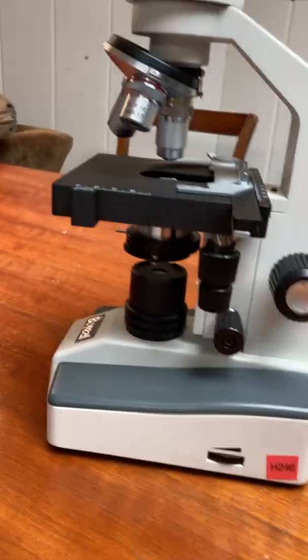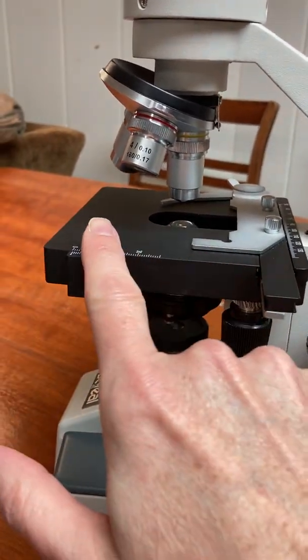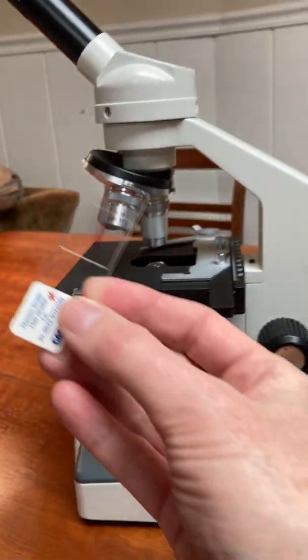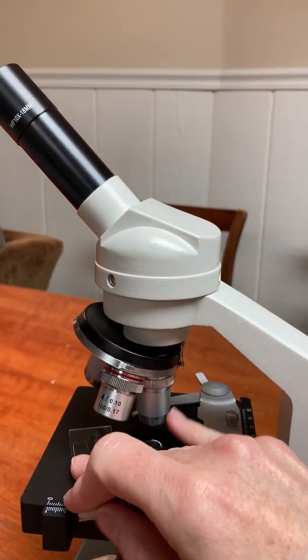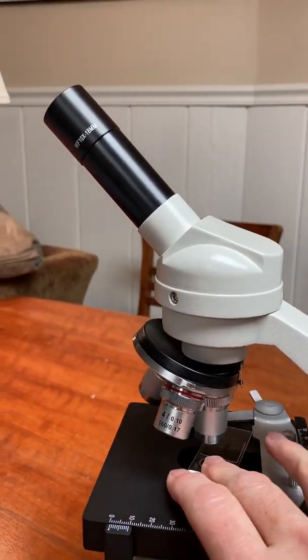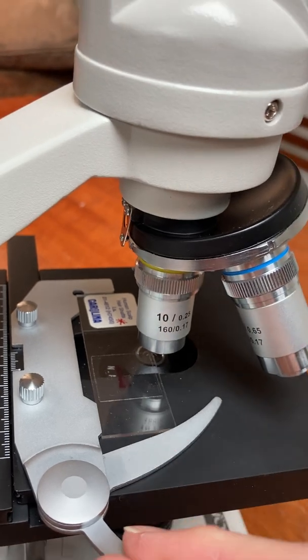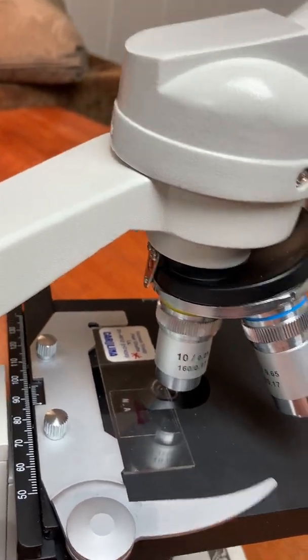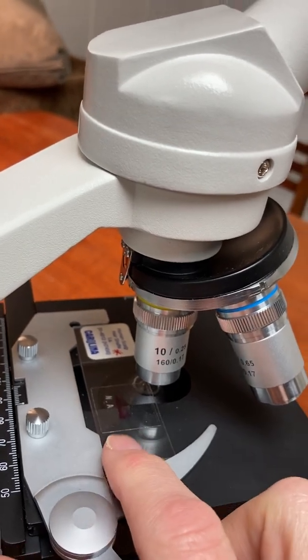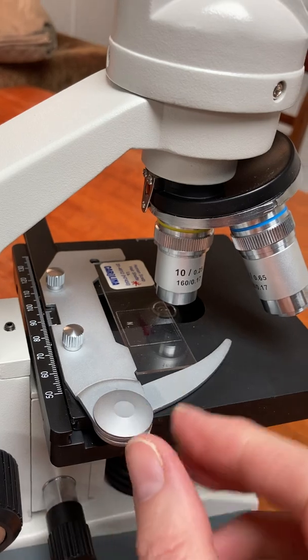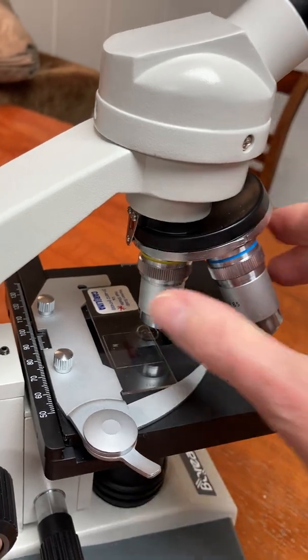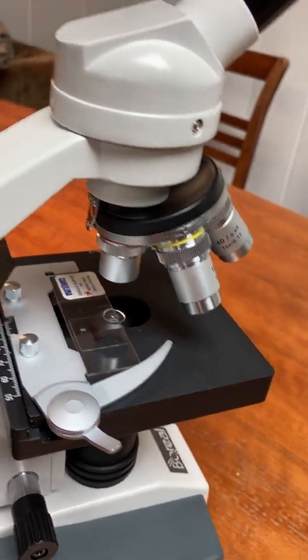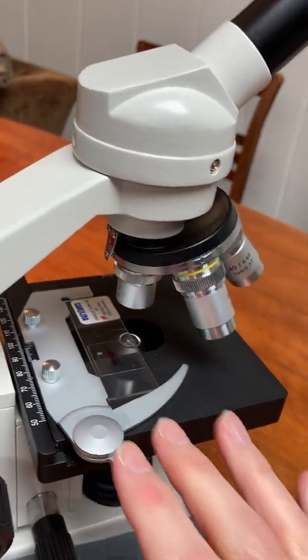The next vocabulary word is the stage which is this platform where you put the microscope slide and here is a microscope slide. So you put it onto the stage in a way where the stage clip here holds the microscope slide in position, in place. See that? That's so that the slide stays put and doesn't slide all over the place on the stage. So stage is the black stage and this is the stage clip.